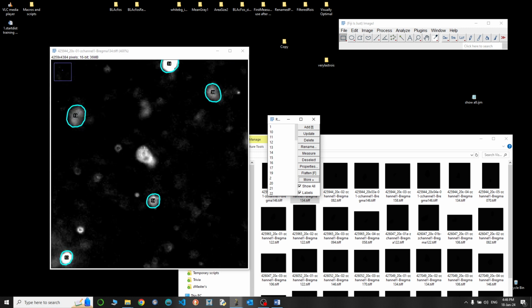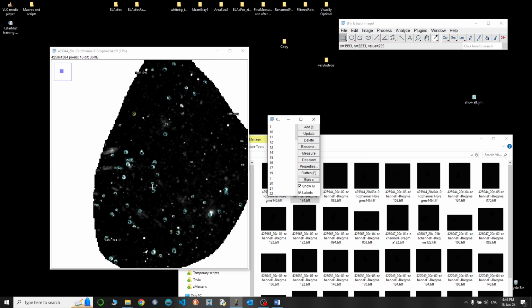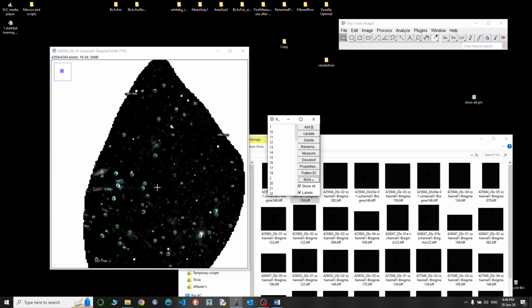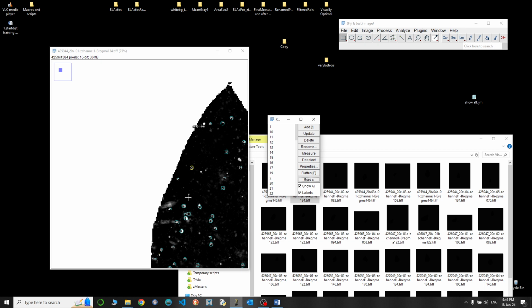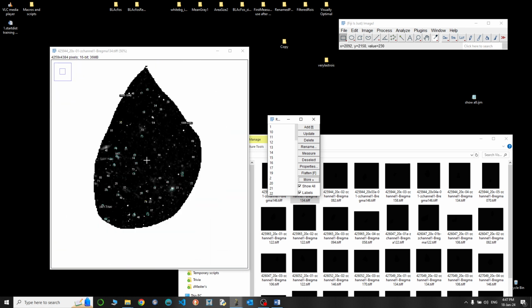You can remember there was a blue one that we excluded. And what else did we do? I think we salvaged these two guys, this guy and this guy. Now, from now on, these are your final rows. It doesn't matter if they're yellow or if they're blue. These are all included there. It's just that you can see what you added, with these strange numbers and yellow contours, what you salvaged with this yellow, and what you kept from the rest, the included ones.